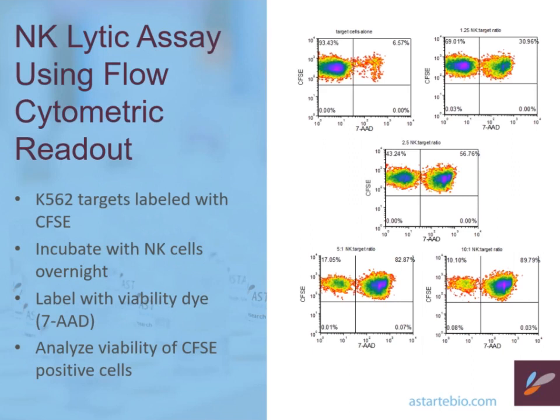There are other methods kind of coming online that measure cytolysis using luminescent labels or even non-labels, but detecting release of antigen or release of internal proteins. And these may allow better readout of this important function of T cells.